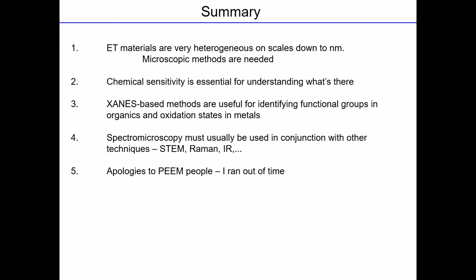At ALS, we're going to have this upgrade to ALS-U in a few years, and our tychography microscope is definitely in line to be put on a new beamline. We're also going to have a tender X-ray tychograph, so that'll go up to 8 kilovolts. I see. That'll be really interesting.